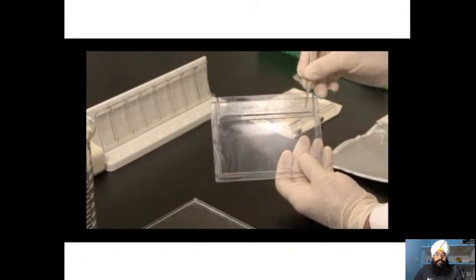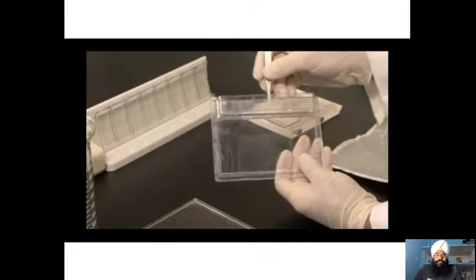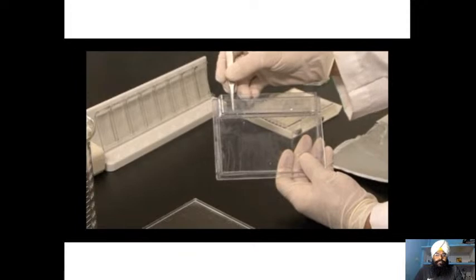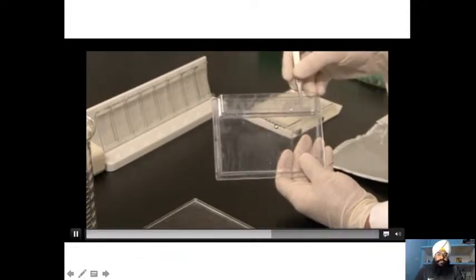Place the IPG strip gel side up. Place the plastic backing against the back of the cassette. Position the strip centered in the middle of the well with your forceps and gently push on the strip until it touches the gel. And you can tell when it's touching because you'll feel a little bit of springiness, a little bit of resistance. Don't push too hard.